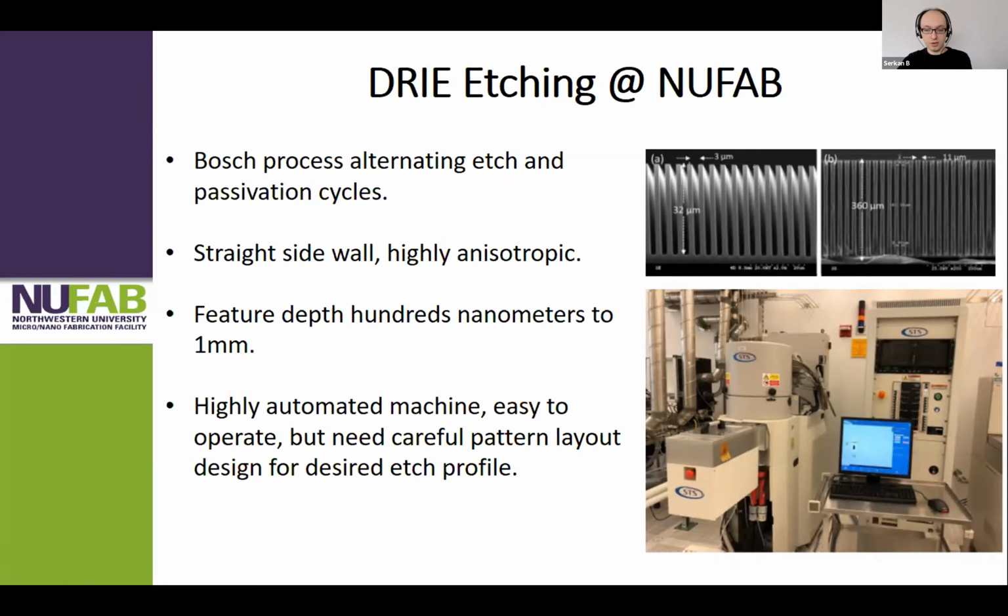All right. So it's a very nice machine, but you will have to do the lithography as Suhan mentioned in the beginning. But the nice thing about this method is that we use standard positive photoresist, which has high resolution and is very easy to work with compared to SU8. And that lithography step will take you, if you're an experienced user, at most half an hour, I would say, and then you can easily etch your pattern into the silicon mold. That way you can have a very robust mold.